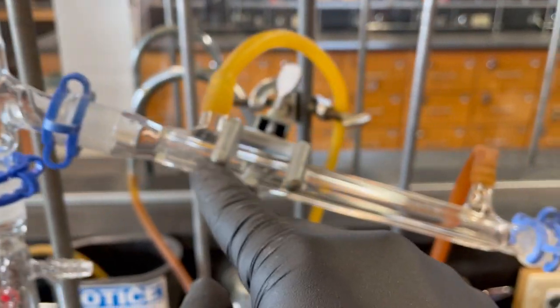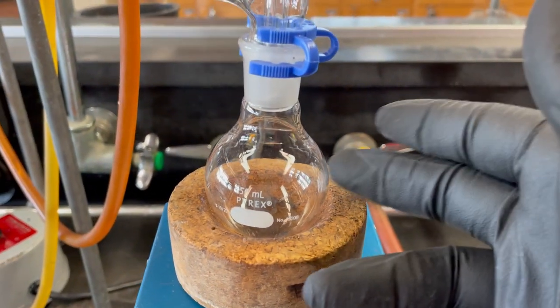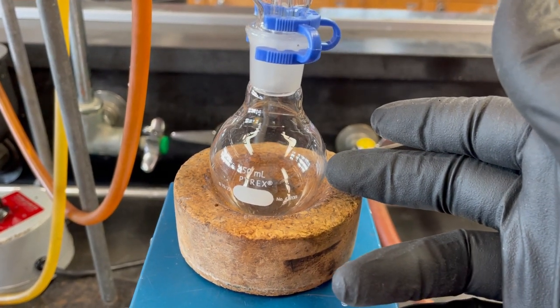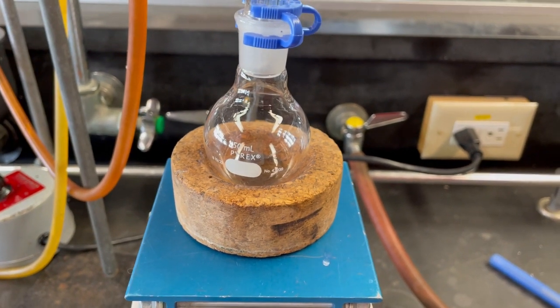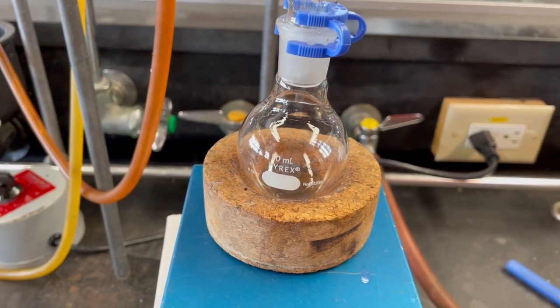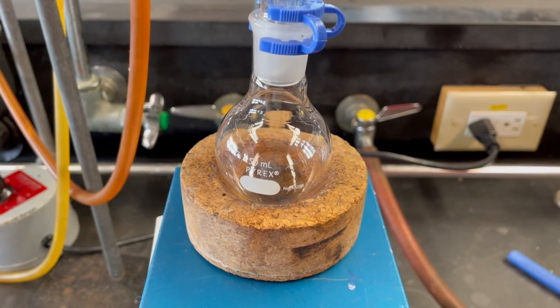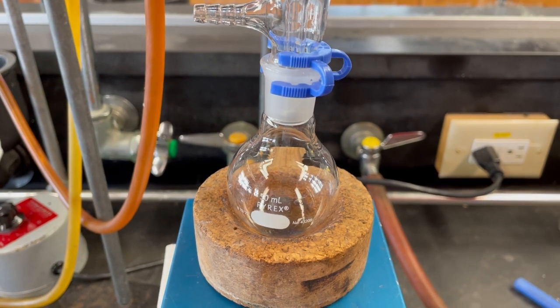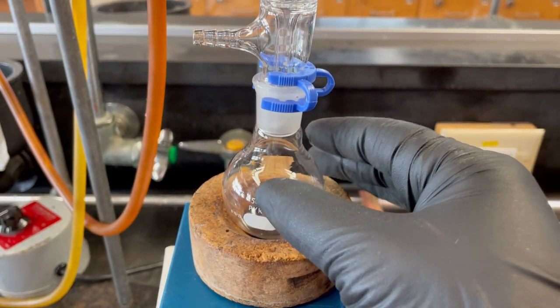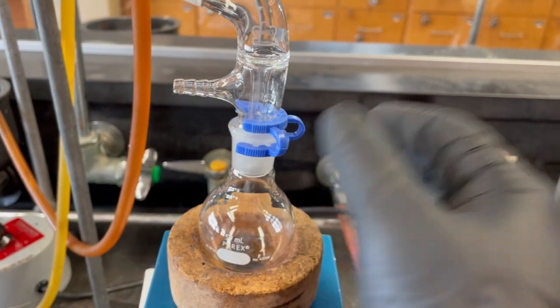Okay, so that liquid will condense here and drip down into here. Okay, so the first little fraction, what I want to do with that is throw that right in the garbage. So the first little fraction is going to be something else, and it's acetaldehyde. Acetaldehyde is a byproduct in this fermentation process, and sorry, I didn't know if I wanted to tell you or not, but I will tell you. You can just kind of deduce the mechanism for me later. But yeah, we don't want that. We always want to throw that first fraction out anyway, just a little bit collected in this flask, throw it right in the garbage.